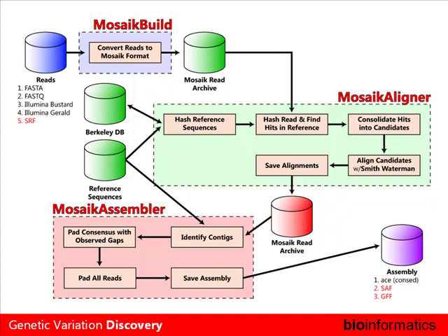So it's kind of this difference between being theoretically a very hard problem, I wouldn't say it's an NP hard problem, because it isn't, and being able to do this in practice. So we're able to do this really fast. Like for small yeast genomes, with an 8-core computer, we usually align like 100,000 reads per second. So you can do these pretty fast.